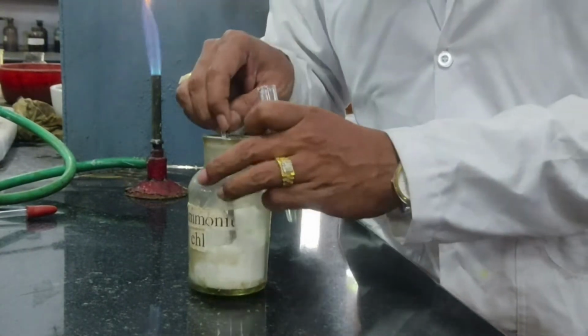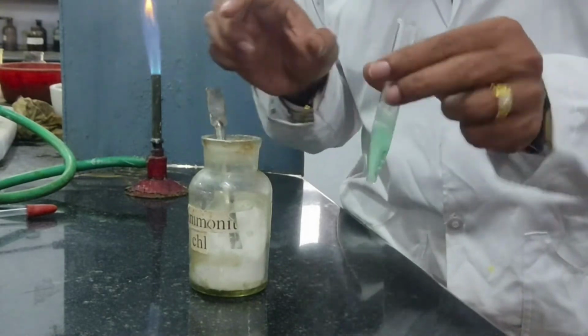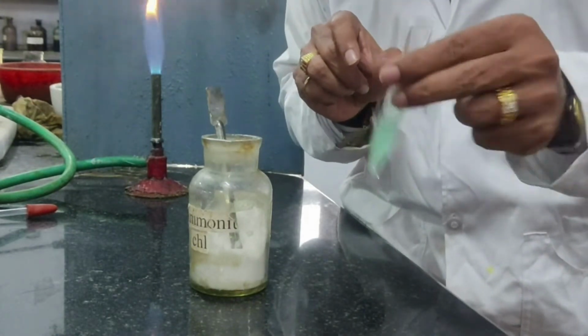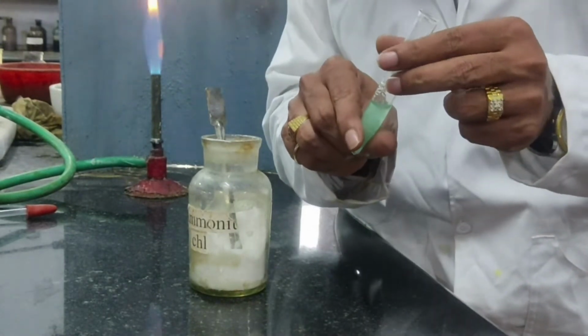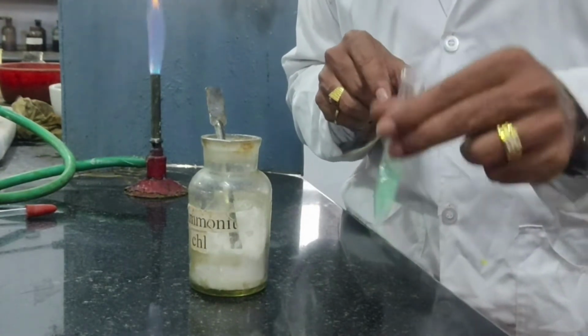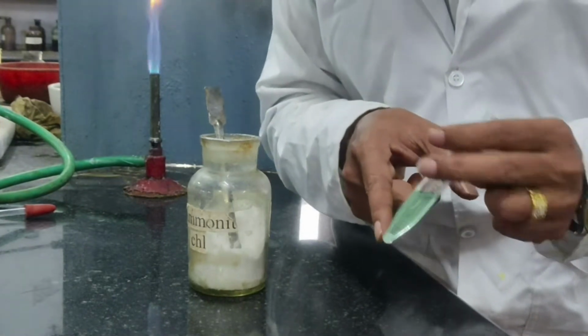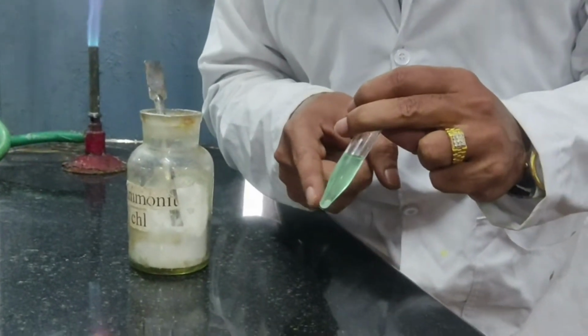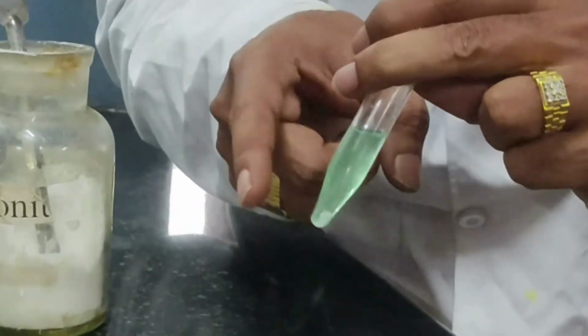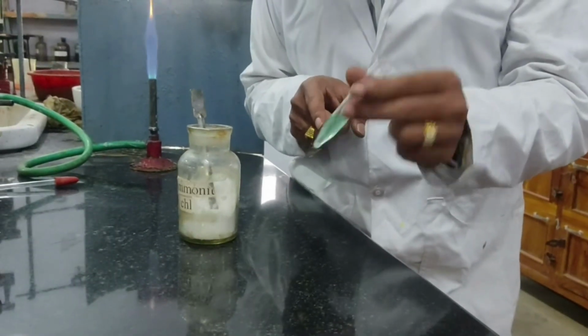Addition of ammonium chloride to the solution is an endothermic process. That is the reason why if you touch this particular test tube, it becomes very cool. Okay, so I have added enough amount of ammonium chloride. You could see little amount of ammonium chloride left at the bottom of this test tube, right? So I got a saturated solution of ammonium chloride.